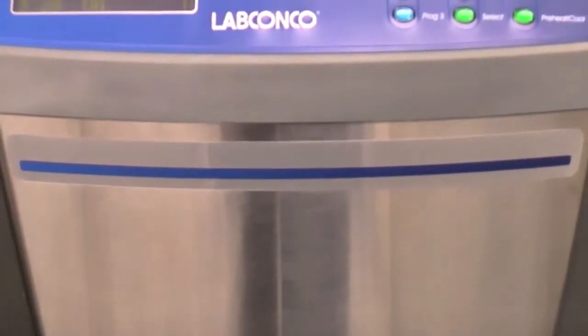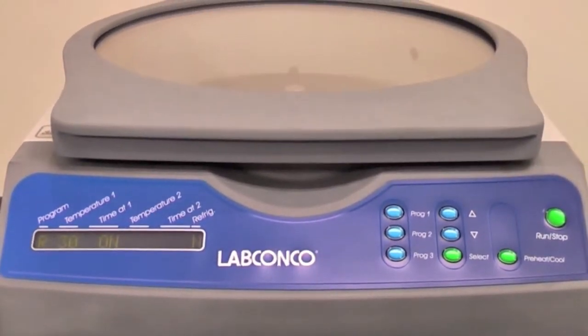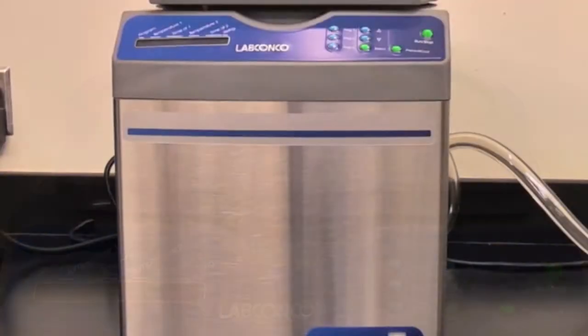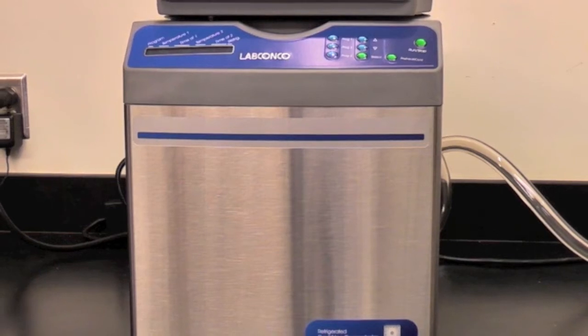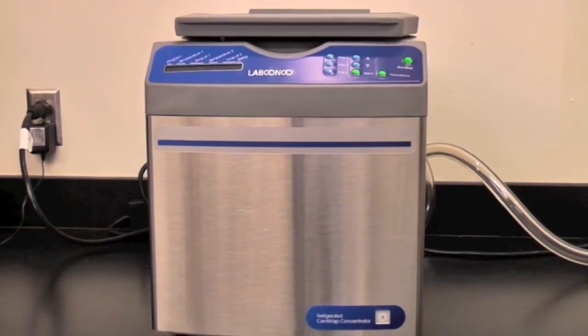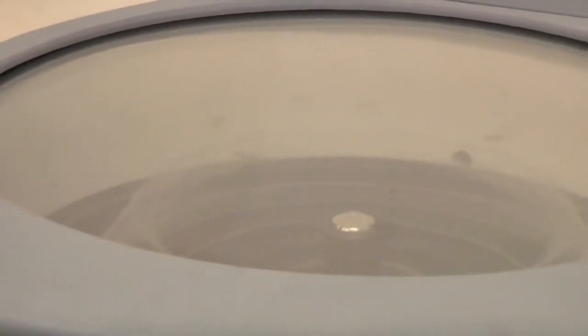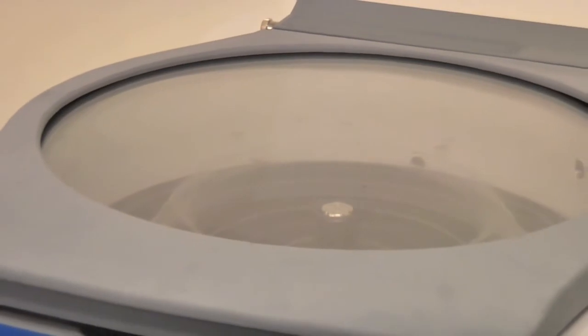LabConco's refrigerated Centrivap is the only vacuum concentrator that cools down to minus four degrees C and heats up to 100 degrees C for heat sensitive samples such as RNA and proteins. By using centrifugal force, vacuum, and controlled temperature, you're assured to have viable dried samples after the run is complete.